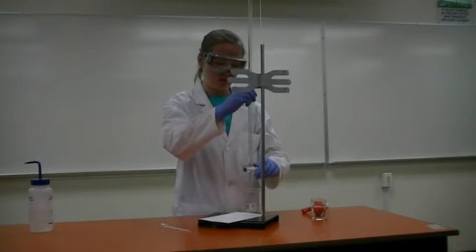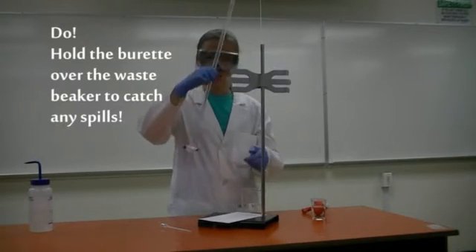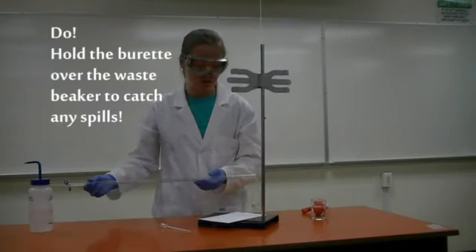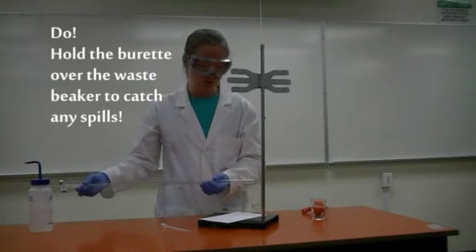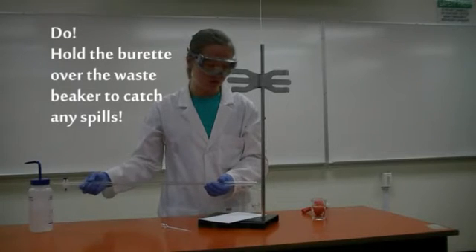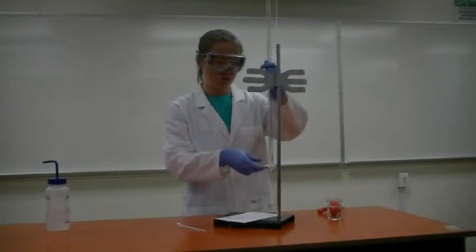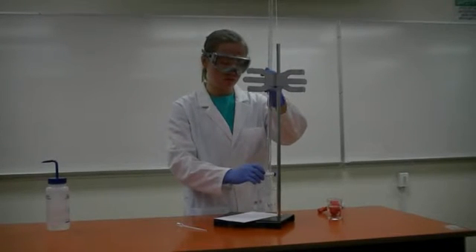So we are rinsing with about 10ml of water. Remember to hold the burette over the waste beaker to catch any spills. We are using small volumes of rinse water and sample solution to avoid waste. Remember to drain through the tip of the burette.